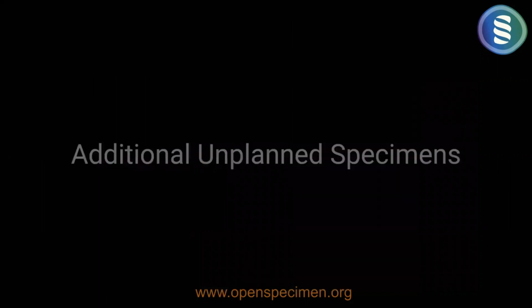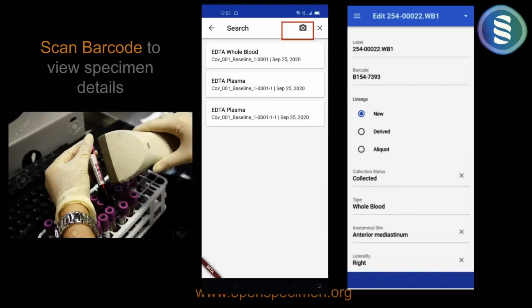As I said, one of the things that we wanted to do, similar to scanning a specimen, is to scan a box. This is because in the last year we have started working with a lot of labs that have 50 freezers, 100 freezers, large farms of freezers, and a lot of boxes move around from one freezer to another, or are checked out, checked in, etc. So it is much easier to use mobile apps in those scenarios than a laptop.